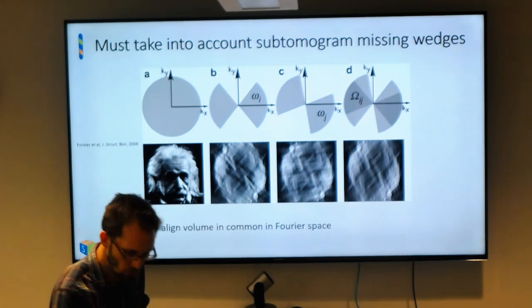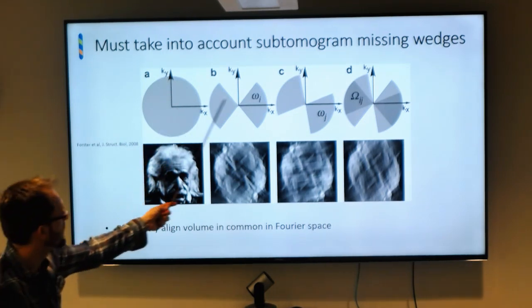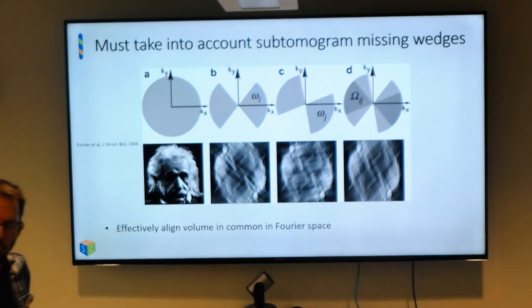Is the sub-tomogram averaged on many pictures? Like for B? Say for B, you took many pictures of randomly oriented pictures with missing wedge, and then you average them and you get that. Yeah, if you take B and C and you average them, you get that. That's what's happening. If these are ribosomes floating around, and you average them all together, that's what B would look like. No.